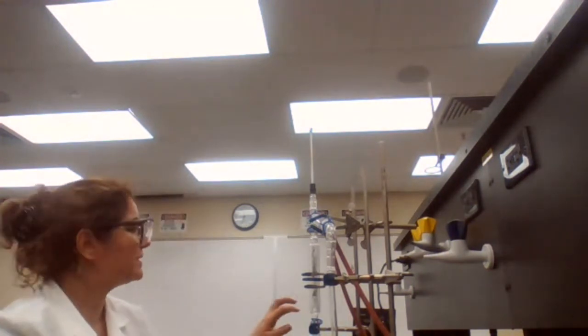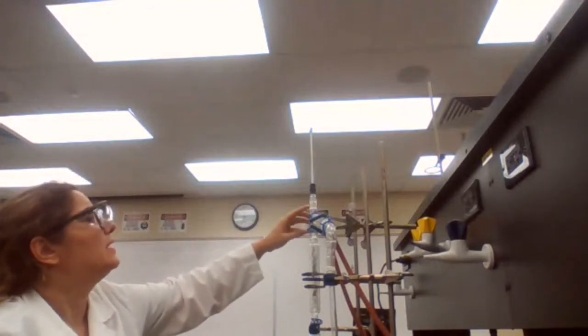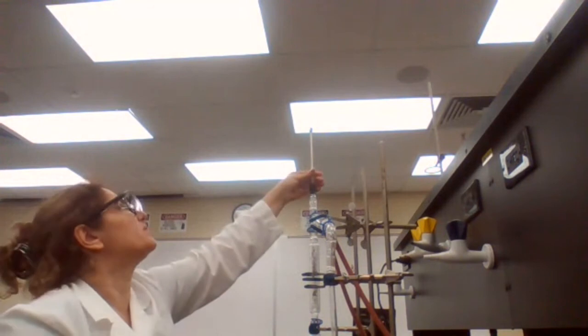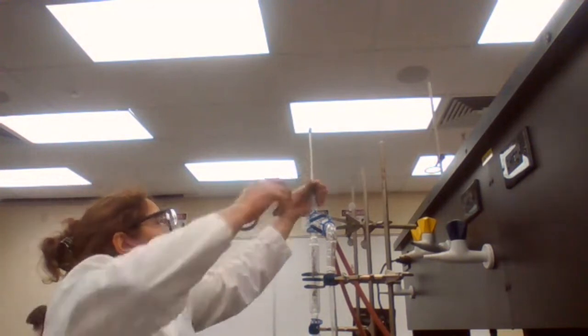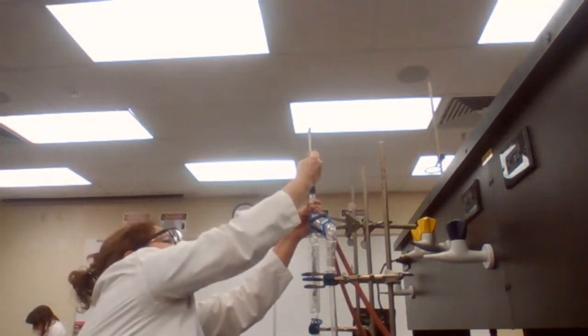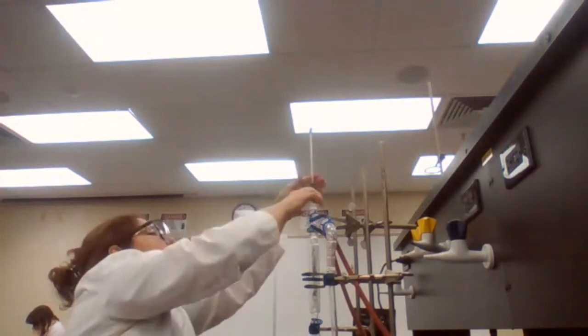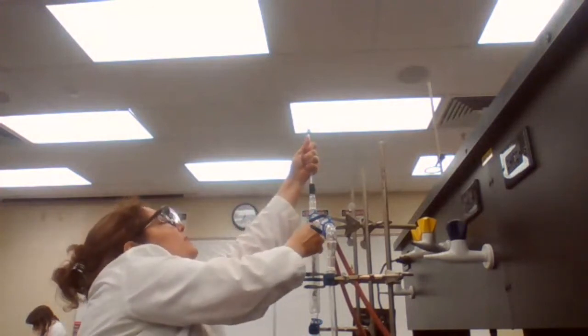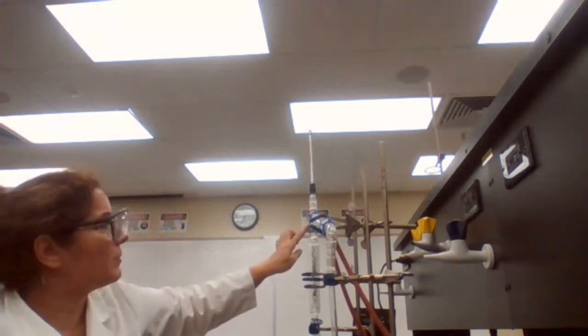The vapor pressure is not what is decreasing, that is a good point. It's not the vapor pressure that is decreasing. In fractional distillation, you are going to have vapor of the first compound reaching the condenser, actually passing through the thermometer to reach the condenser first, right? And then compound 2 is going to start coming up. So at the beginning, it's just compound 1 with the lower boiling point that is going up and reaching the thermometer.